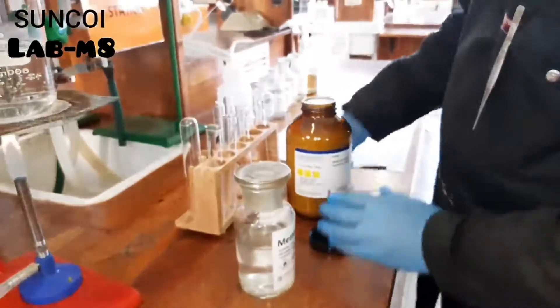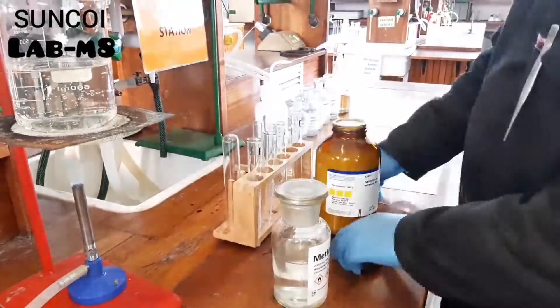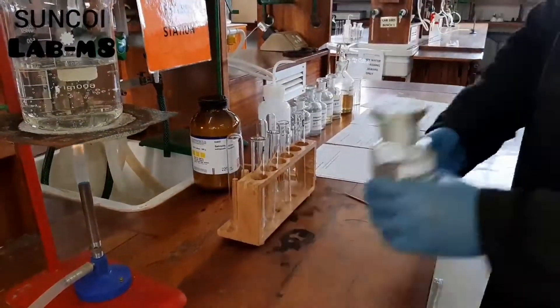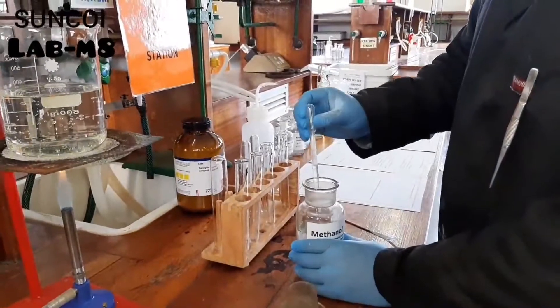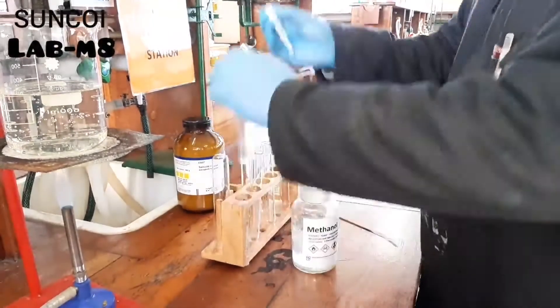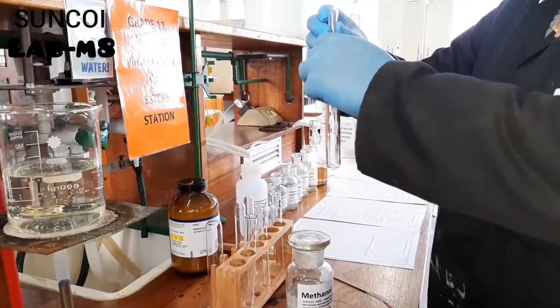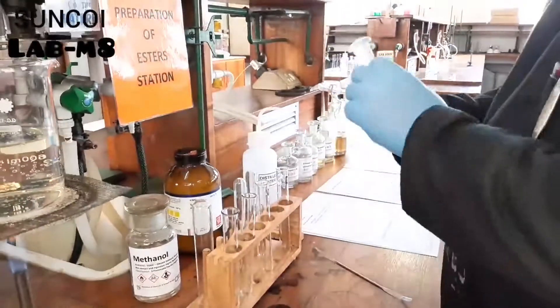For experiment A, Jaquin adds salicylic acid to a test tube. He then adds a few drops of methanol to the test tube, and then lastly he adds some sulfuric acid to the test tube.